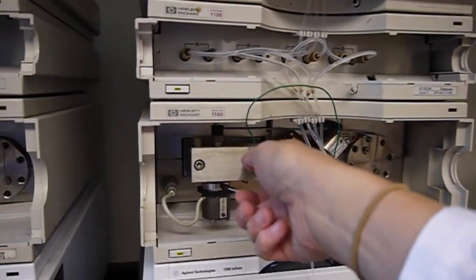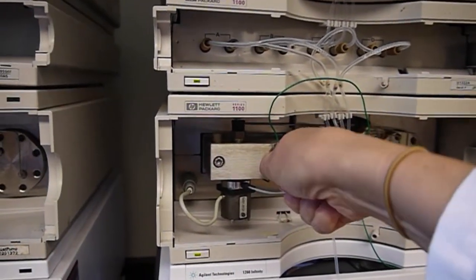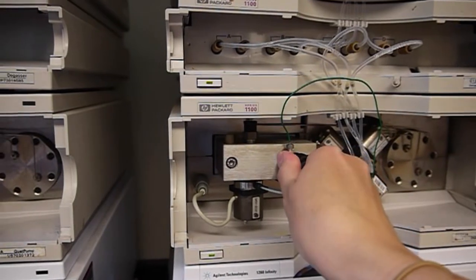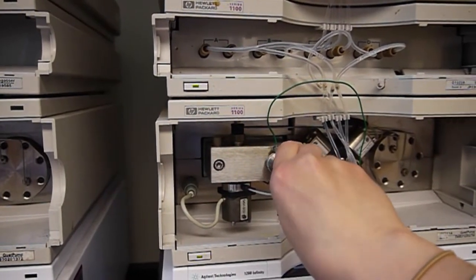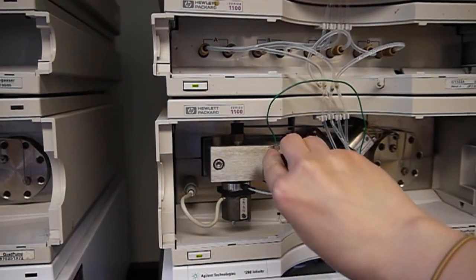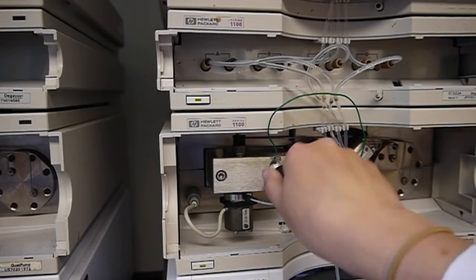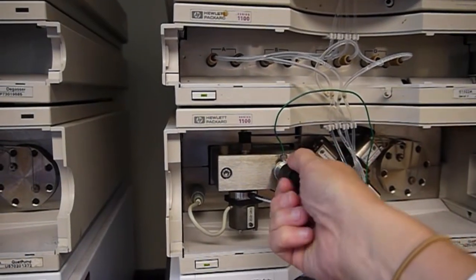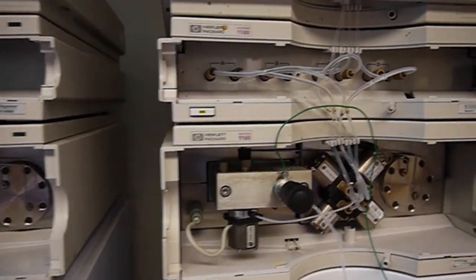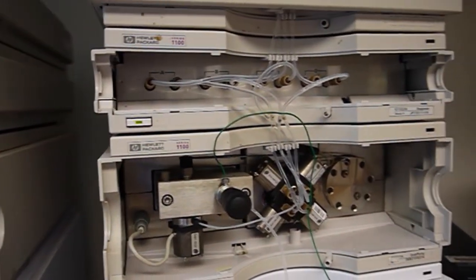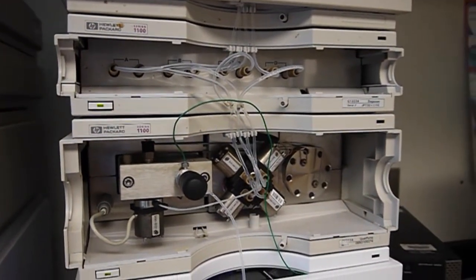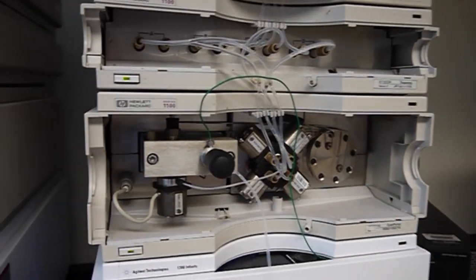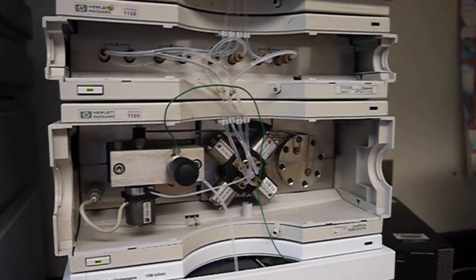I'm going to open the purge valve. You'll feel it reach a point where it releases, and then I'm just going to go a little bit past that, maybe half a turn. You don't want to unscrew this all the way or you'll get solvent leaking out there.